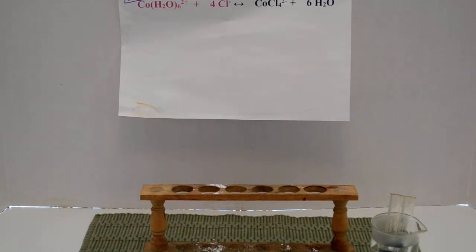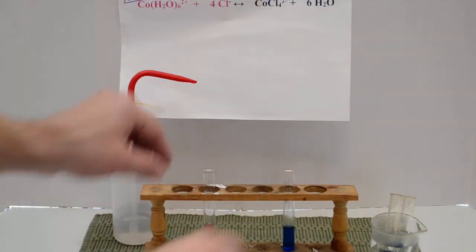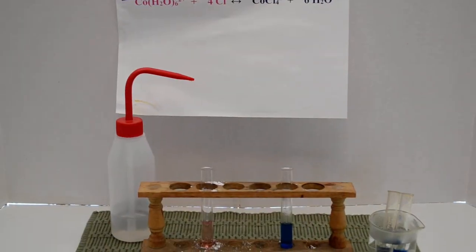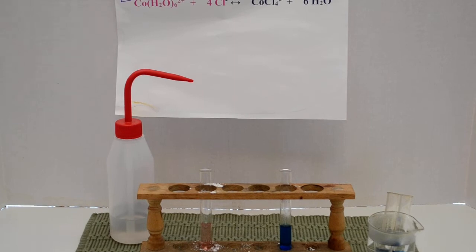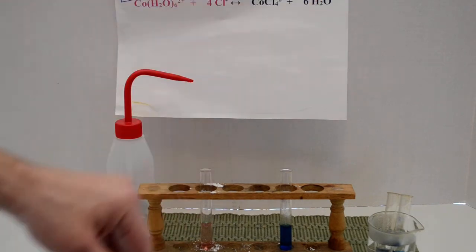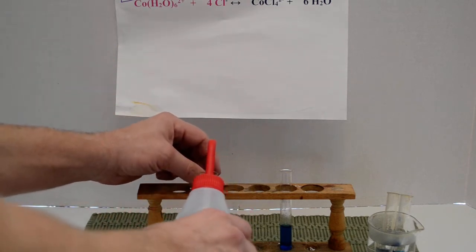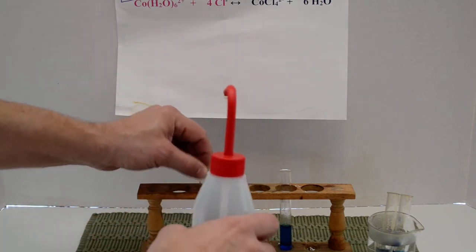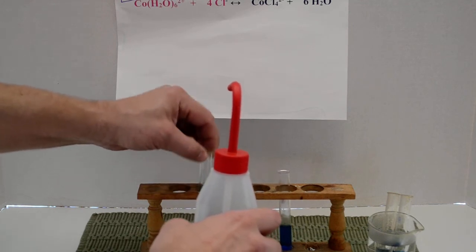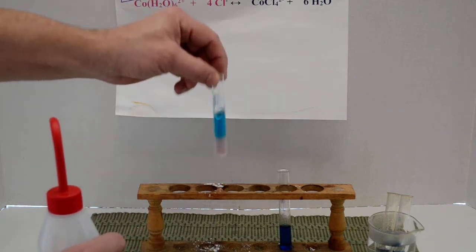Okay, good job. Okay, so acetone is another one that's going to act a little differently than we're used to here. So what acetone's going to do, when we add acetone in here, it's going to be removing water. So again, when we add acetone, acetone is going to essentially remove water from this. Okay, so let's add acetone to the pink one. Oh, we already see stuff happening. Shake it up a little bit. It looks like the pink one is turning blue.